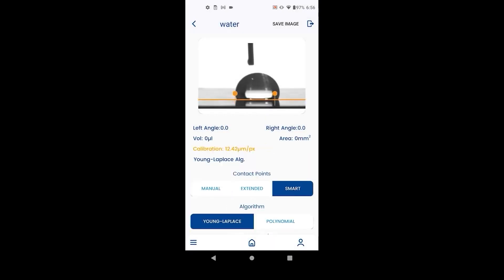The Young-Laplace method is the recommended method for axisymmetric drops. It will average out the difference between left and right contact angles. Unlike the polynomial method, needle has to be outside the droplet and we need to do the calibration process to use this method.